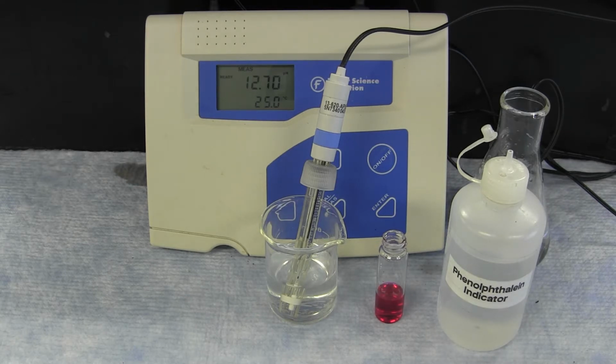Overall, the pH meter is a much more accurate way to measure the pH of a solution, to a higher level of significance and a better precision.